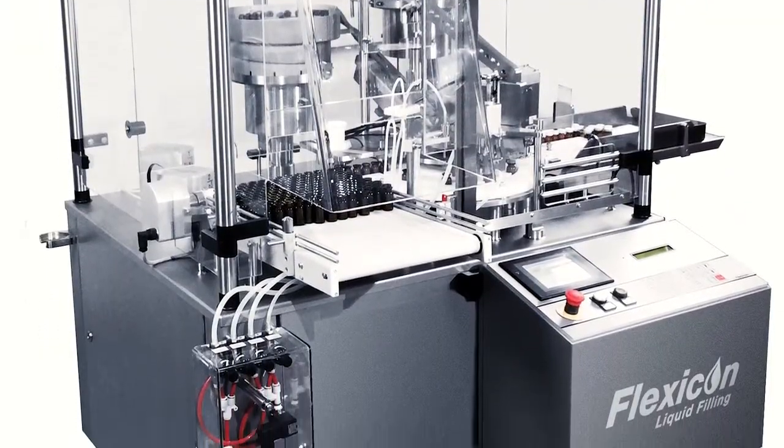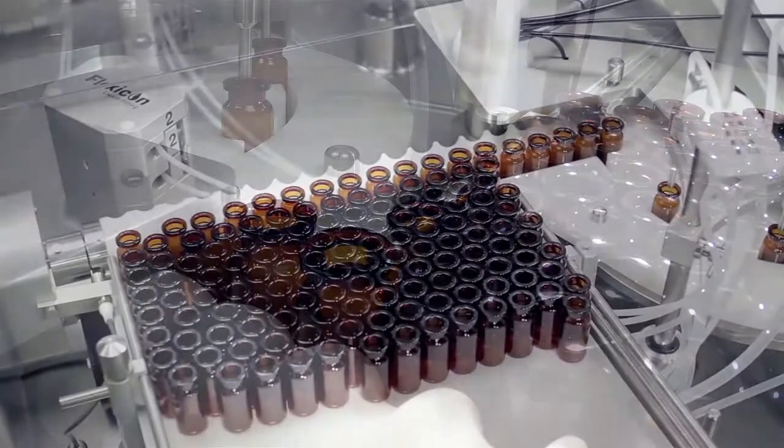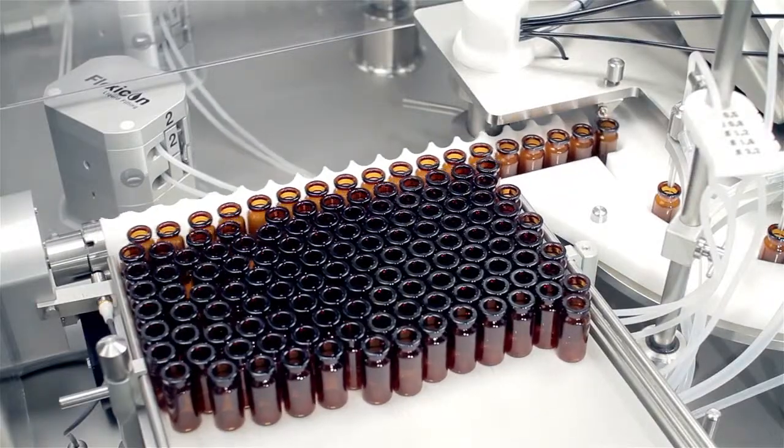The system is modular and easily customisable. Vials can be fed from rotary tables or, as shown here, a more compact infeed conveyor.